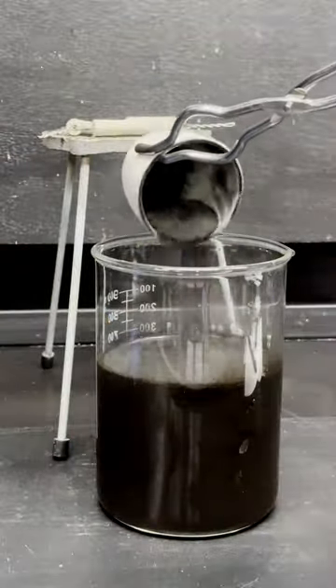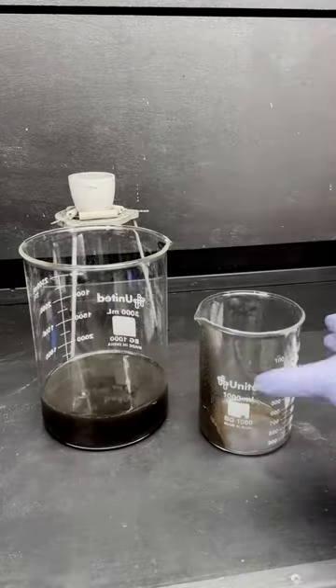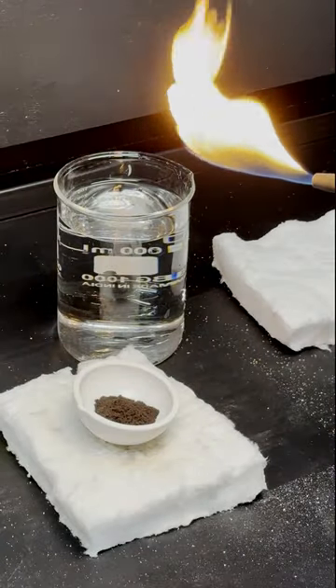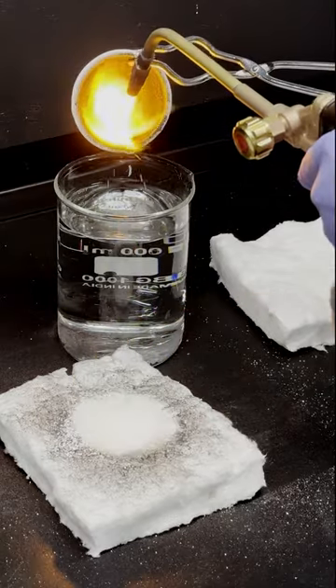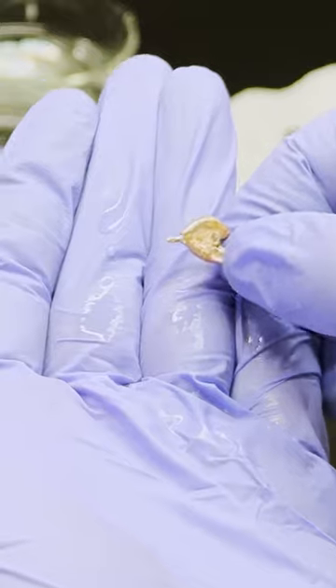Once it's cooled down, I'll rinse it with water and decant the liquid off to separate the light leftover charcoal. This powder is so fine that it doesn't really look like copper, but once I melt it together with a torch, it turns into a lump of copper metal made from paint.